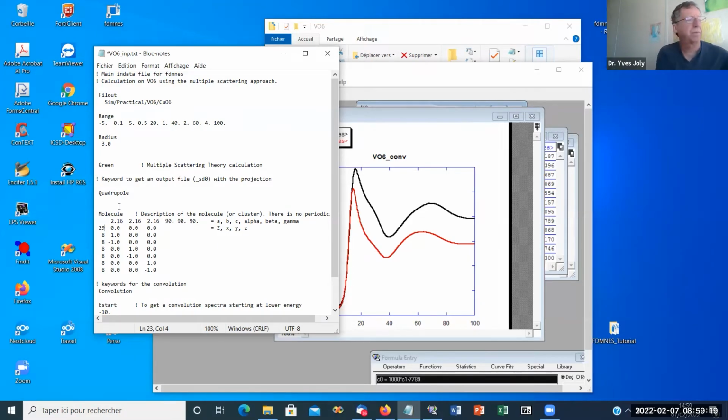Yes, I have. I've noted that in that case, you have one long distance, 2.18, and two short. And I think it has been seen by XANES a long time ago.